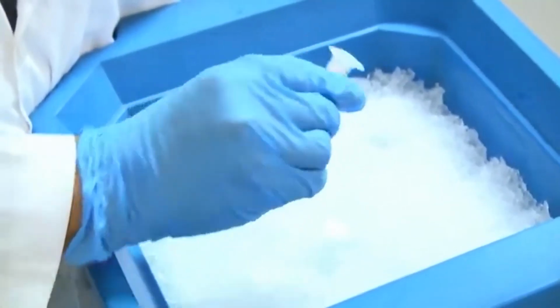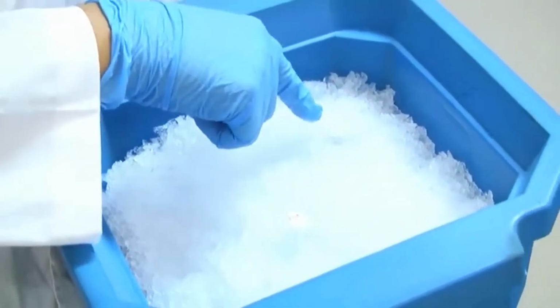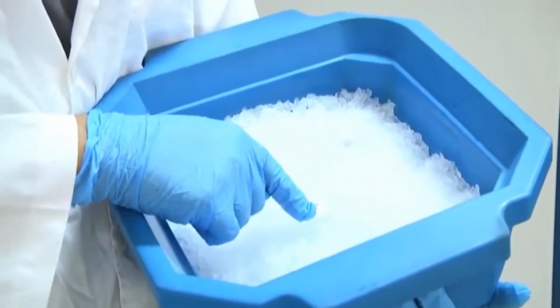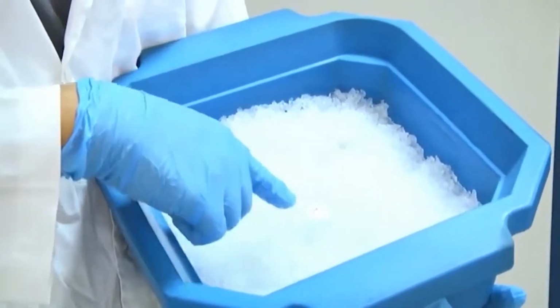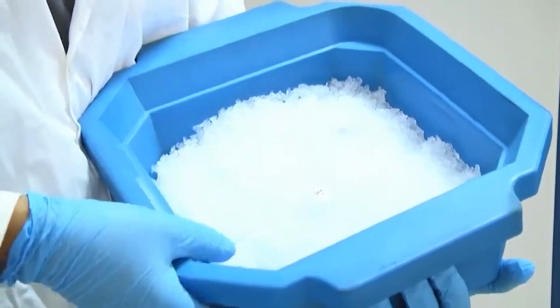So, this is that, and what I am going to do in our next step is take a small volume, maybe 1 microliter of DNA from the ligation product vial and add it to the competent DH5 alpha cells. So, this vial, I am not taking it out of ice because that will defeat the whole purpose of the experiment. This vial contains 50 microliters of competent DH5 alpha cells.